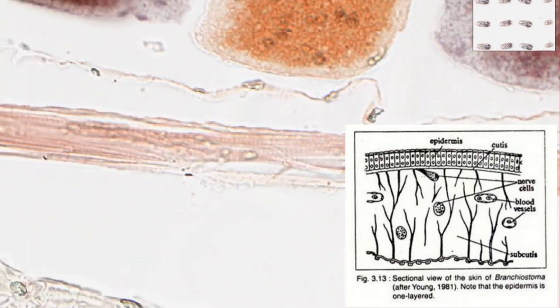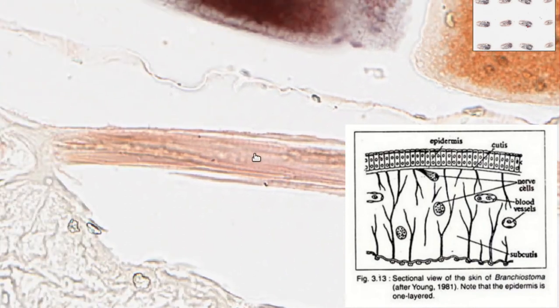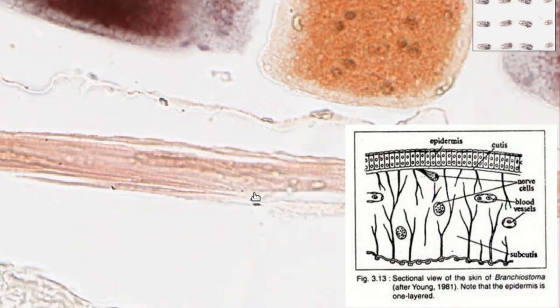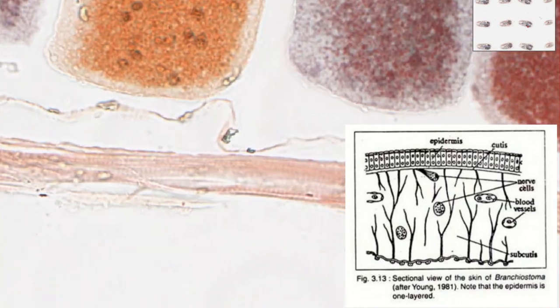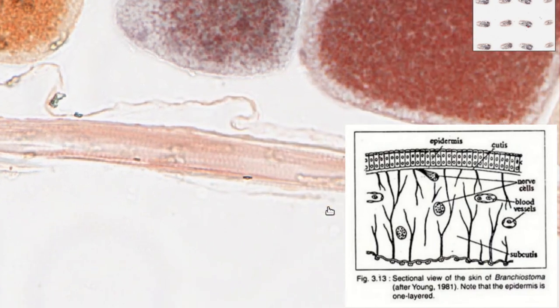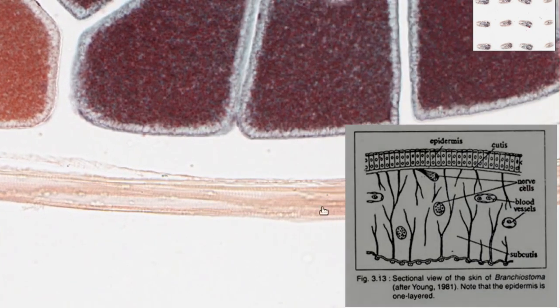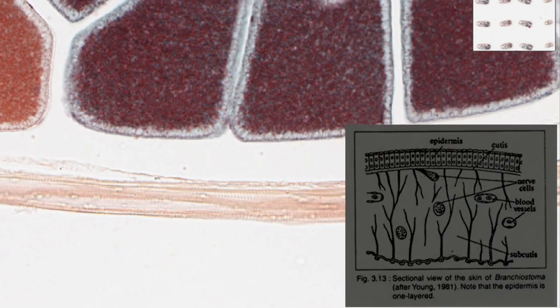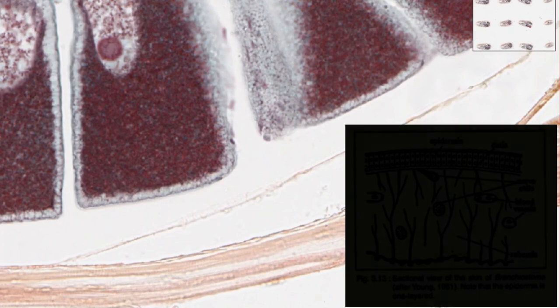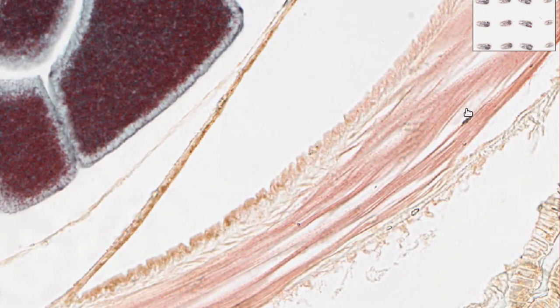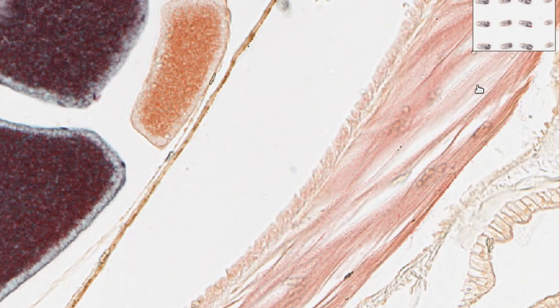So this here looks like a bit of muscle to me. It looks like muscle to me because it's in long fibers. And you can just about make out the striations in it. So these alternating bands of dark and light, which are where the actin and myosin, presumably, I'm not sure if they have the same proteins in branchiostomes compared to higher organisms, where those contractile proteins overlap or don't.